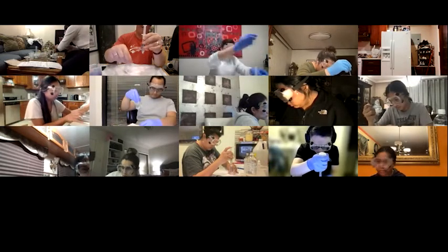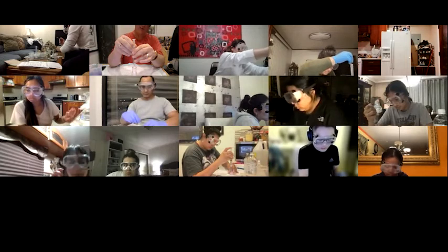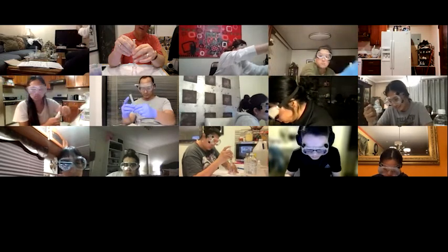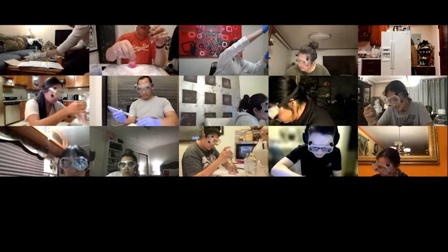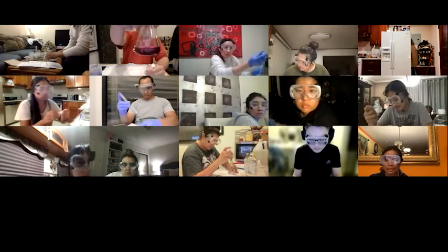Oh, it's so close. Here's where my old professor would tell me to add a quarter of a drop. Oh man, I see what you mean. Yeah, that's one drop. So you're right.